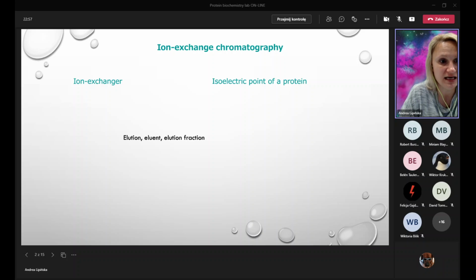Okay. So, you mean the activity or the concentration? You are putting both on the same graph. Yes, but for the concentration with the BCA kit, we only tested the last 4, or the ones that were left. We didn't measure from 1 to 10. We just picked the last one. That's what we were told. We got the activity tested for everyone, but the concentration was tested only for the last samples.